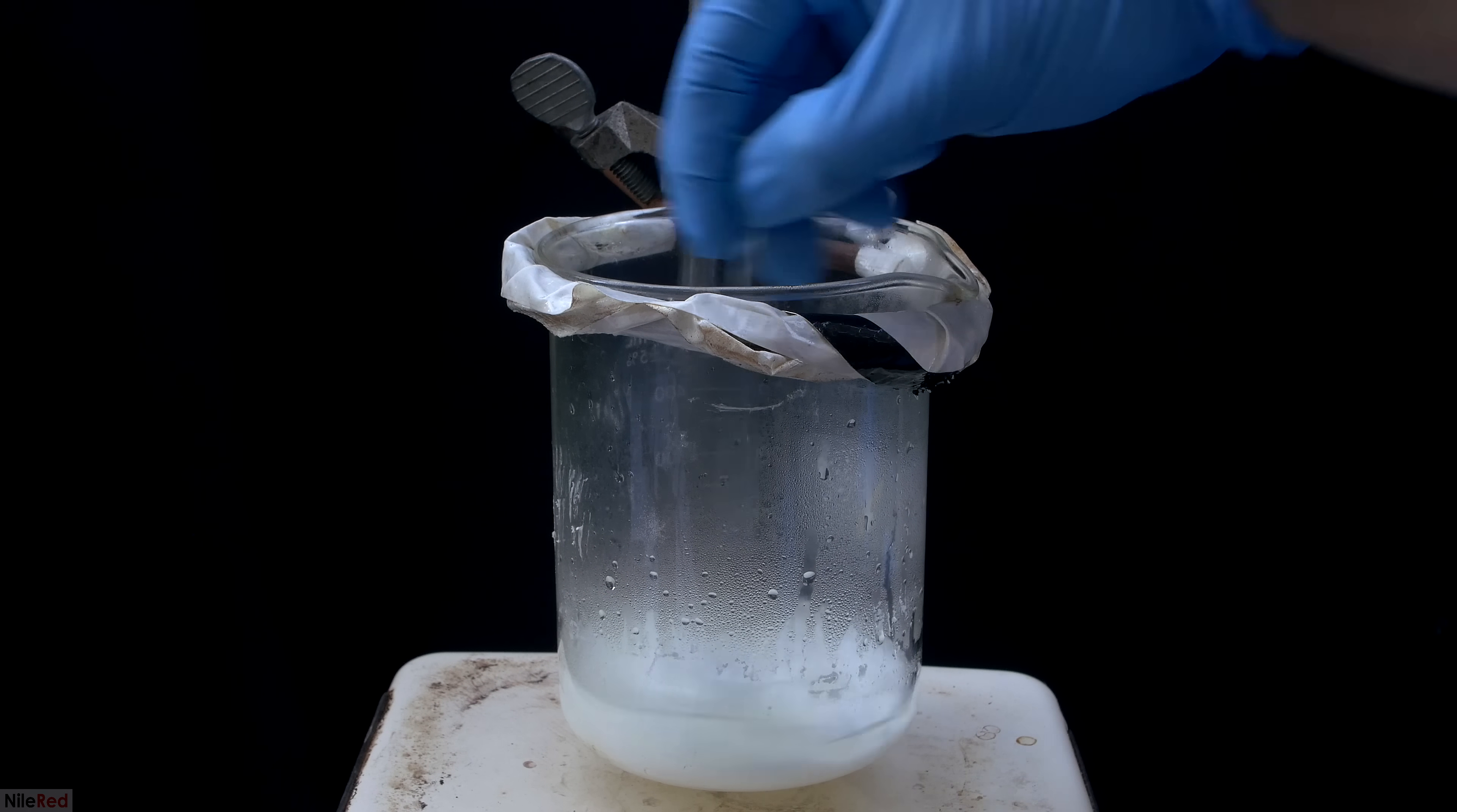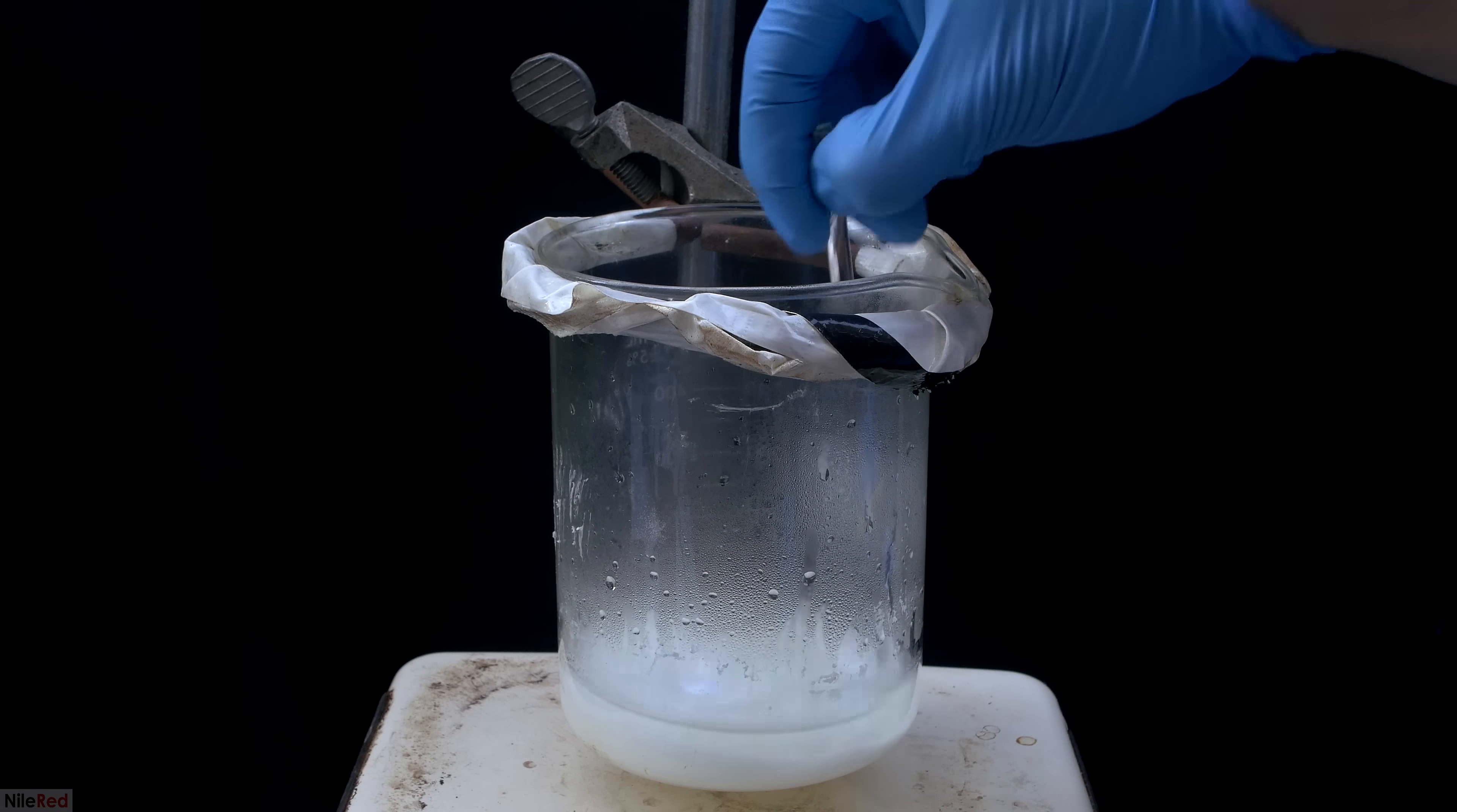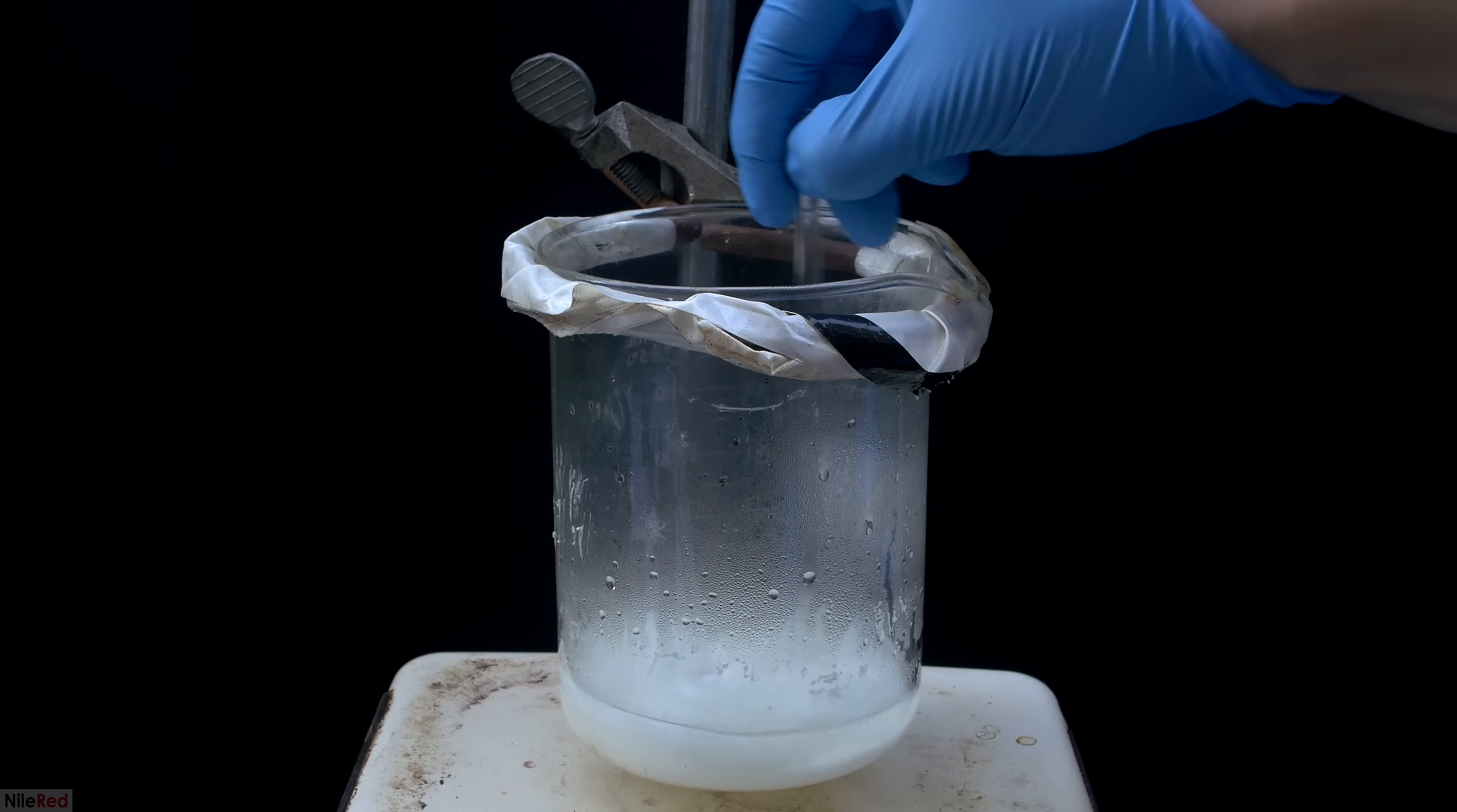As I continue to heat things up and stir, mercuric chloride precipitated out of solution. What we want to do now is continue heating things until all of the water is gone, and we're effectively left with a nice dry powder.